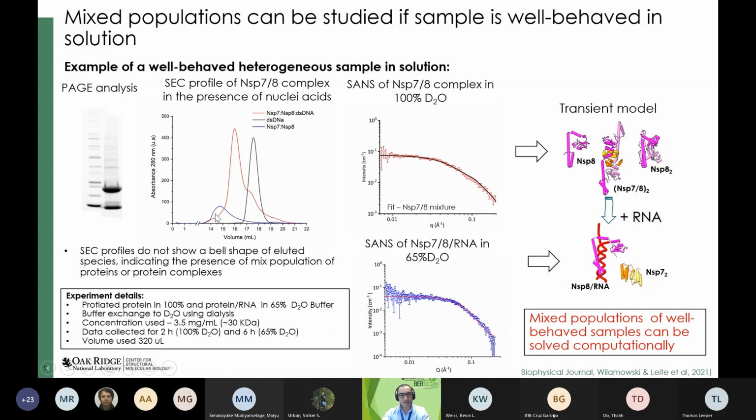It's a protein complex. We have two proteins in the system, so they form a kind of transient complex. So you have monomers, dimers, and tetramers of this protein here. To analyze this data, the sample is still monodispersed, but then you need some kind of computational tools to help you separate those conformations, and even other techniques to help analyze those kinds of data.